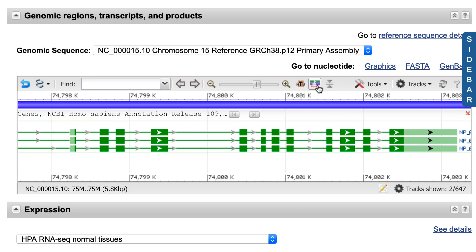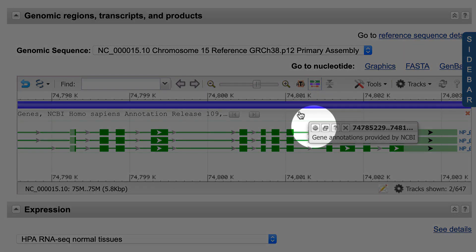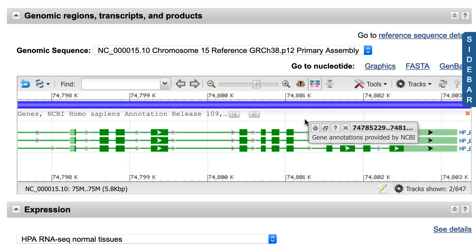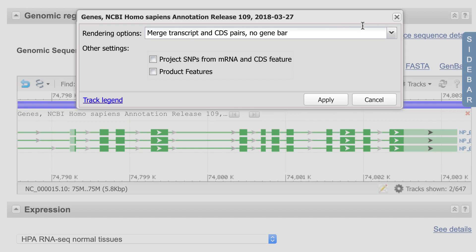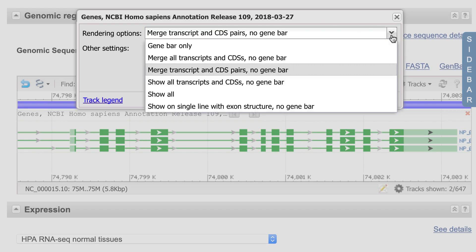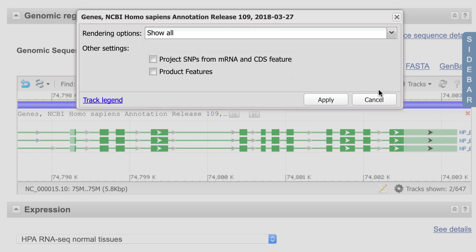Here is another shortcut for changing the rendering options. Mouse over the track name and select the first icon on the left, the gear icon. Now you have the same rendering options menu that we saw in the tracks configure tracks menu. You may also like this other setting: product features.